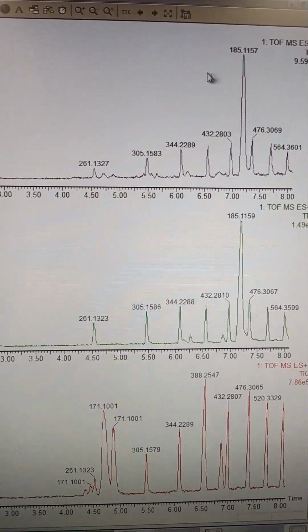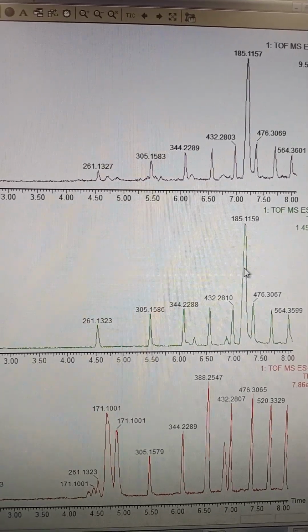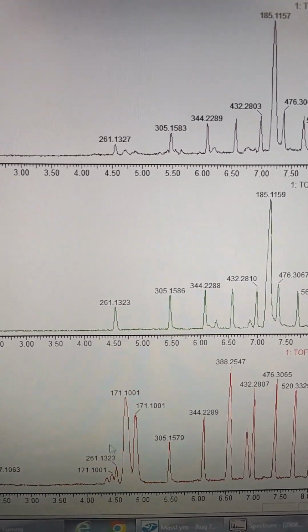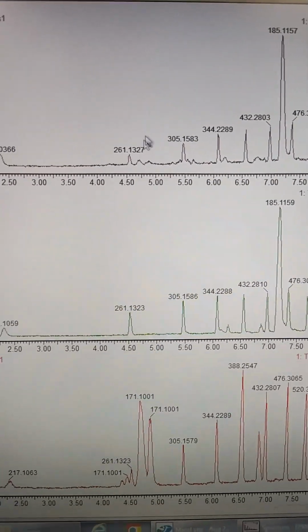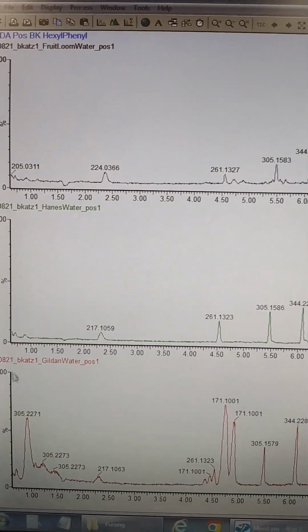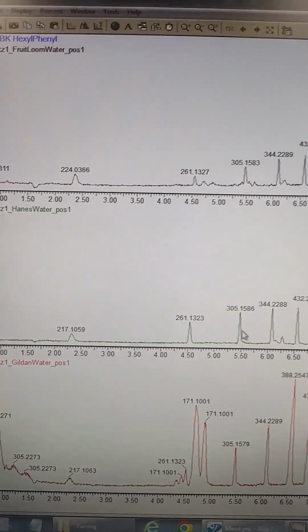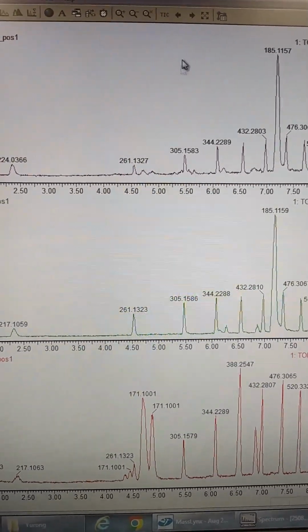We'll try to identify that. But it doesn't seem to have it. It does seem to have a 171 mass set that the other two don't have. So it's slightly different. And then it's got this 305 mass. Again, we're going to try to identify these things, but we may not be able to.